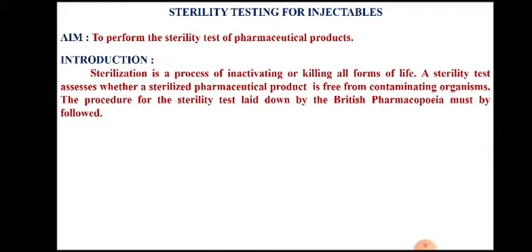This sterility test procedure is designed according to the pharmacopoeia, particularly the British pharmacopoeia. In India, we have the Indian pharmacopoeia. These are the protocols which must be followed according to the guidelines given by the respective pharmacopoeia.